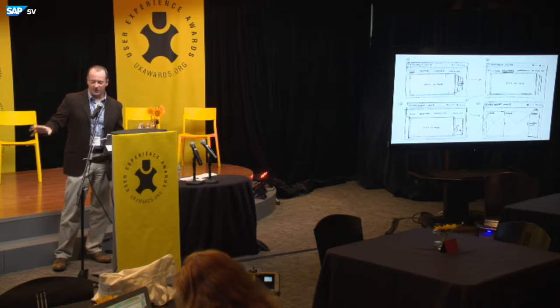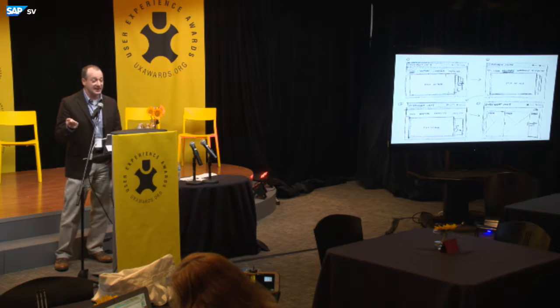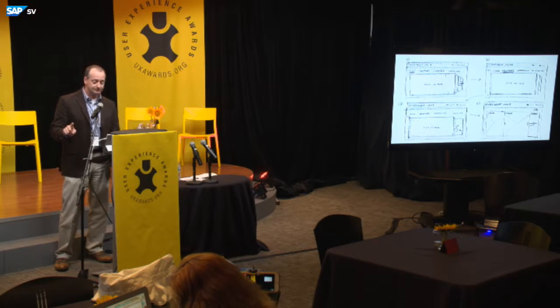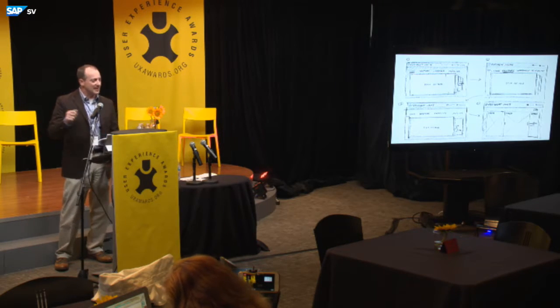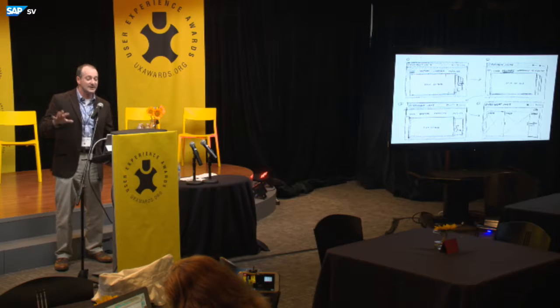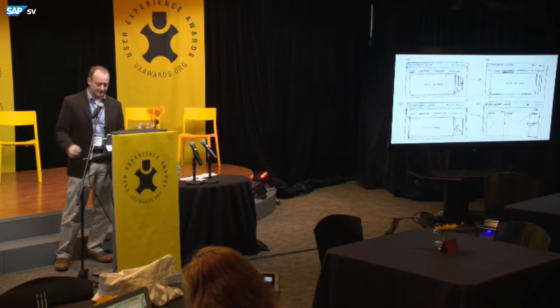We also used the card metaphor to separate basic versus advanced functionality, and I'll show you that in a minute. None of this, however, prevents the experienced users from jumping back and forth the way they would ordinarily. All we have done here is remove from view, unless you request it, that advanced functionality.